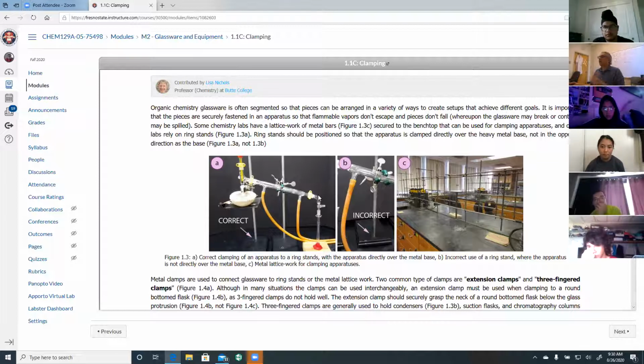So what's important here is the glassware setup. The important part is the round bottom, the distillation head, thermometer, condenser, vent adapter, and the collecting graduated cylinder. So I'm going to quickly switch to, like, disconnect it. No, I'm not going to disconnect it.